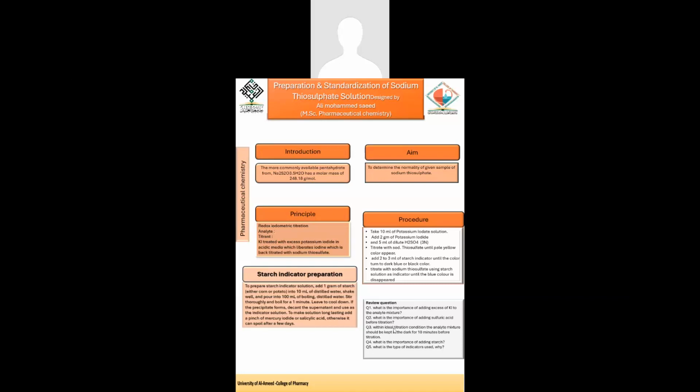With an ideal titration condition, the analyte mixture should be kept in dark for 10 minutes before titration. في وضع نموذجي أترك الرياكشن ميكستشر بعد ما أضيف الأسيد 10 دقائق. هذا الوضع يساعد to help liberate الأيودين من الميكستشر.